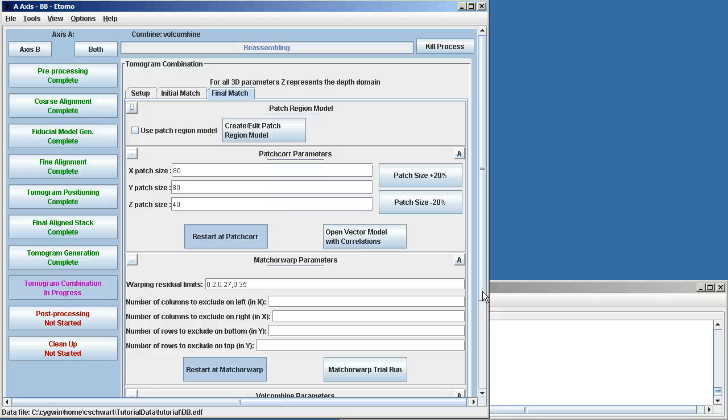And it's finished that part of it. But now it needs to reassemble all the little volumes together and fill in any gray areas. And then it's finished.